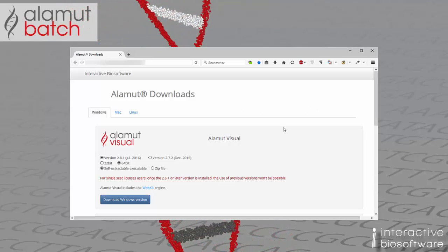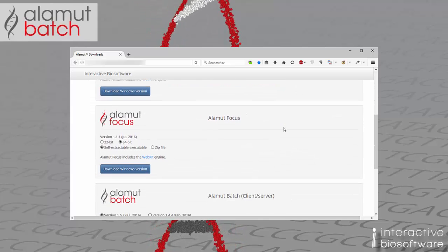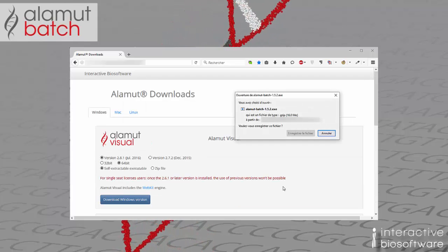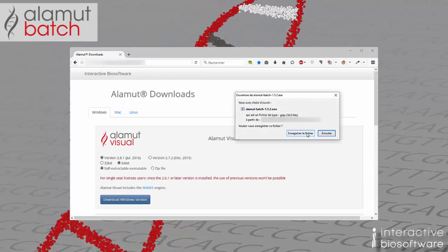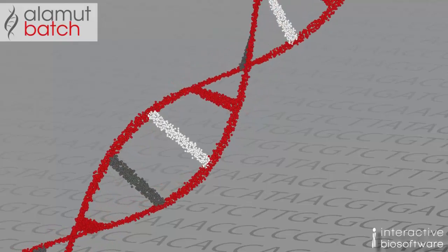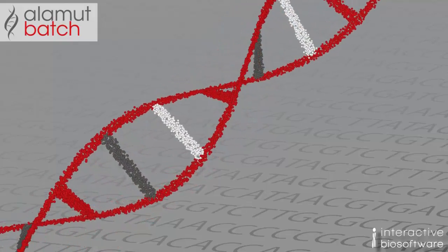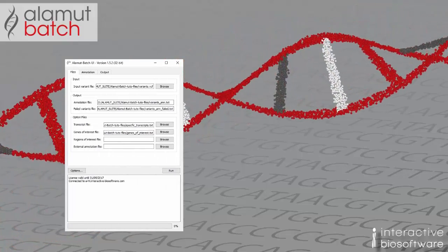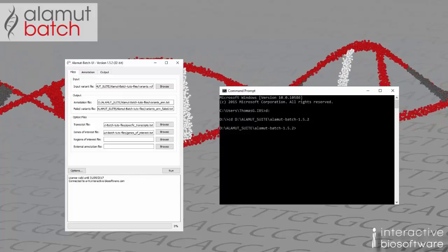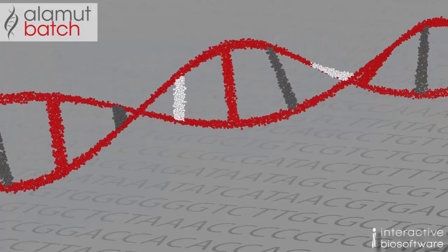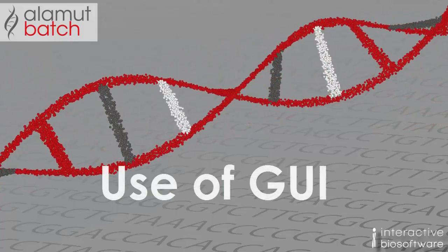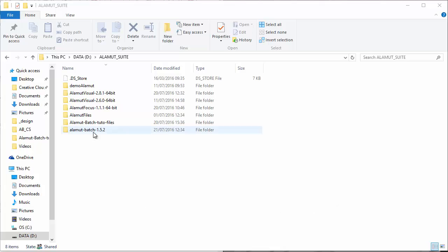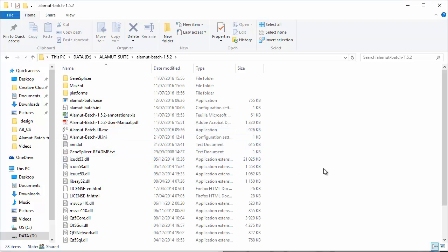You first need to download and install the program. Alamut Batch offers two different approaches for Windows users: a graphical user interface front-end and a command line program. If you want to use the graphical user interface, please select the corresponding application and double-click on it.